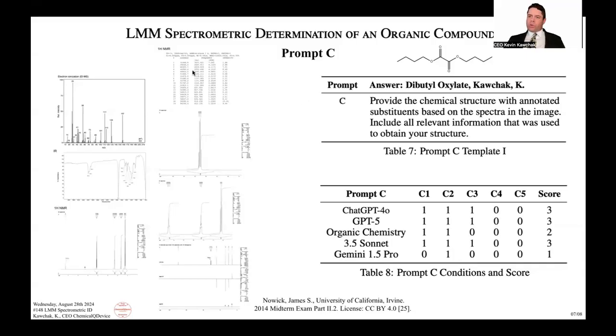So even as a research tool, if you have like 20 or 30 pieces of information, and that's overloading the LMM at this point, either context window or through data fusion, just try doing little steps too, because you can use those as tools. And it's going to be a lot more focused and spend more of its context window on that one specific thing.